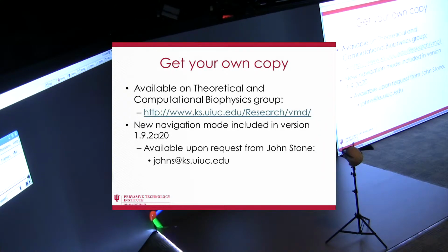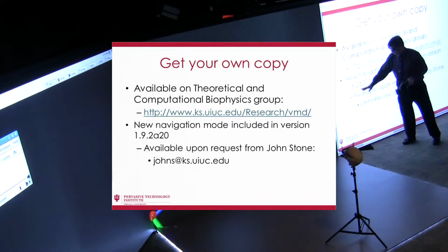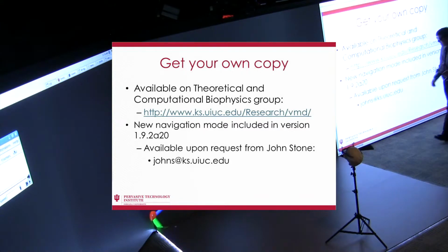All right, and so that's basically it. Anybody can download VMD, although they do have you register. They want to know who's downloading because they tell NSF and the NIH how many downloads have happened. This new navigation stuff is in version 1.92 Alpha 20, and they're probably due to release 1.92 in the near future, but I talked to John, and basically, just email him, and he'll build you one.